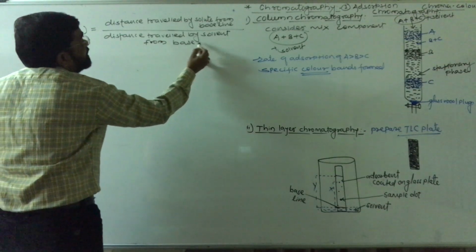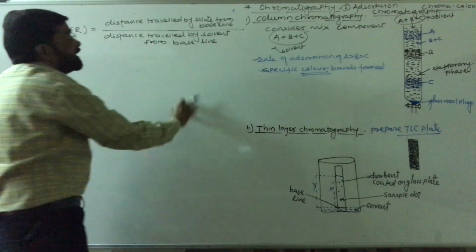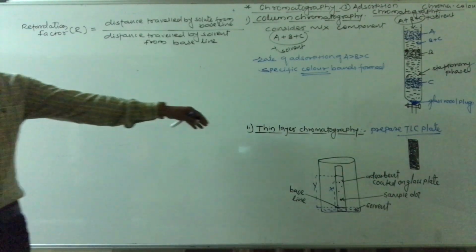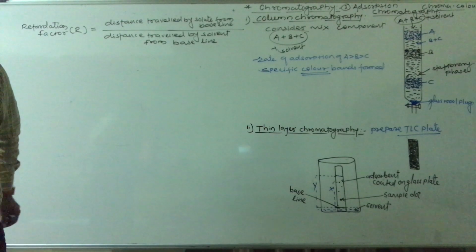So that is nothing but the retardation factor of the liquid component, or that component can be calculated.